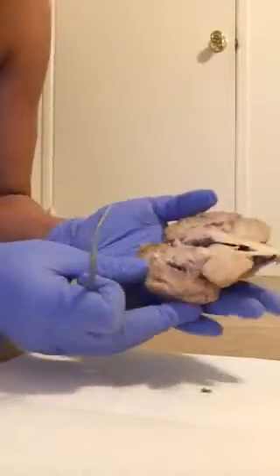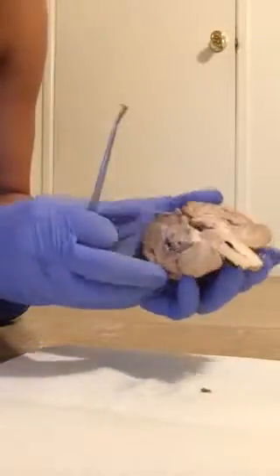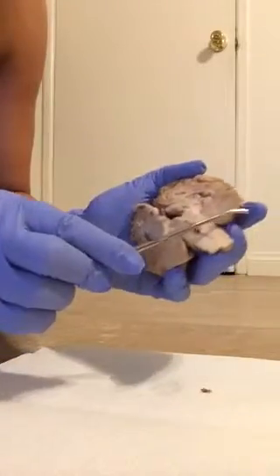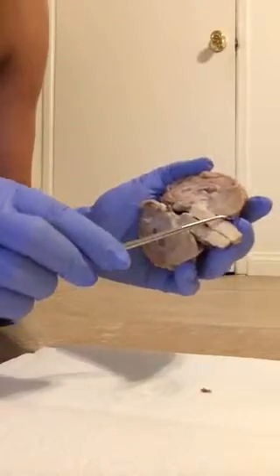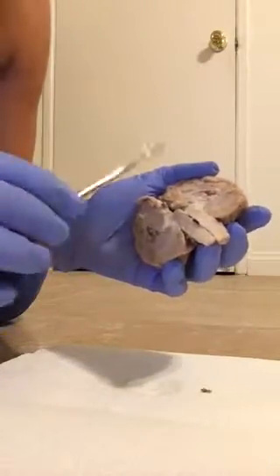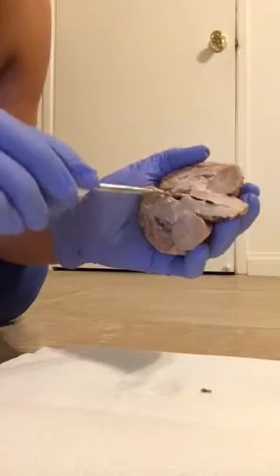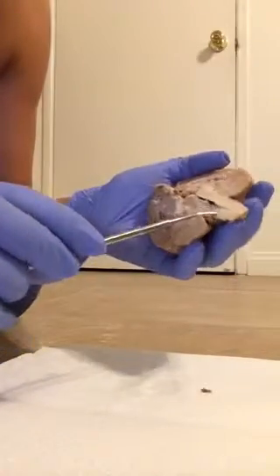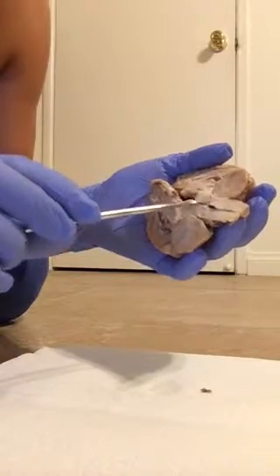So we'll now look at the sagittal section of the brain. Of course, we have our cerebrum right here, and we have our pons here, our medulla oblongata here.